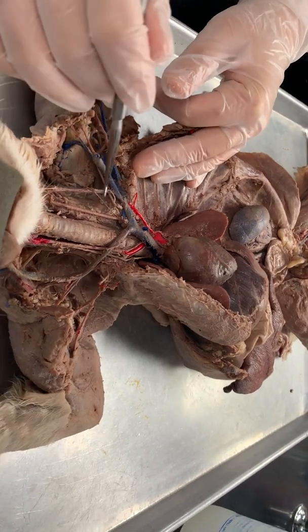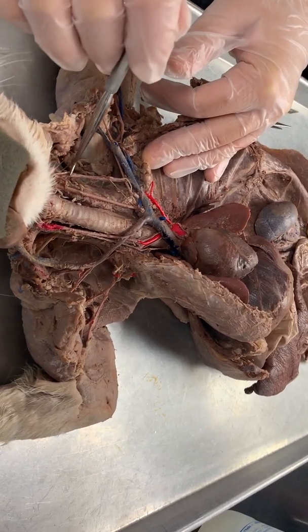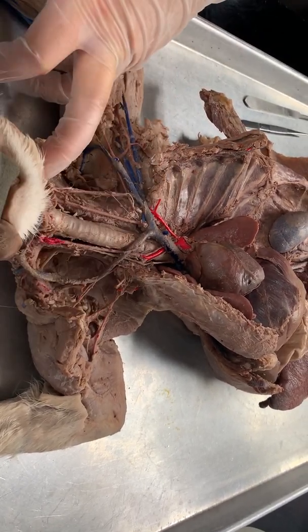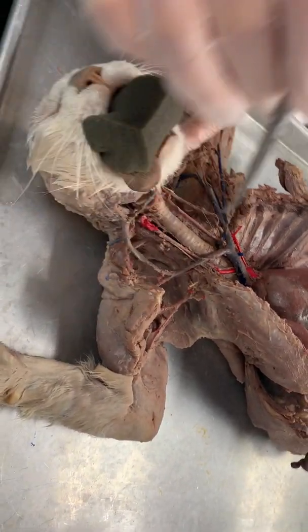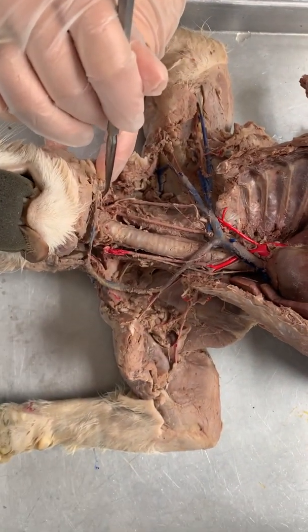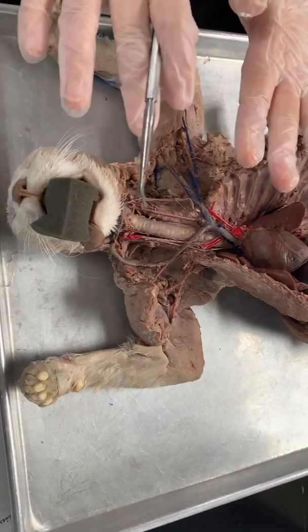Okay, let's see what we can see. Here's common carotid. Common carotid. Did you dissect out the... No. Okay, we'll do facial veins on another cat, or facial arteries. If you wanted to, you could certainly come up here to find your superior thyroid and lingual and so on, but we'll do that on another cat. So that's all above the diaphragm.